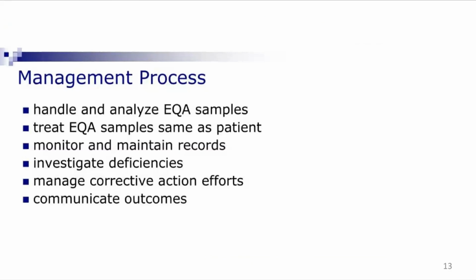In the management system, the laboratory has to see who will handle these PT samples. Even if you are receiving through courier, who has the responsibility to keep these at an appropriate place, who will reconstitute, and who will analyze EQAS samples. And we discussed earlier also, these EQAS samples shall be run by the person who is running patient samples.